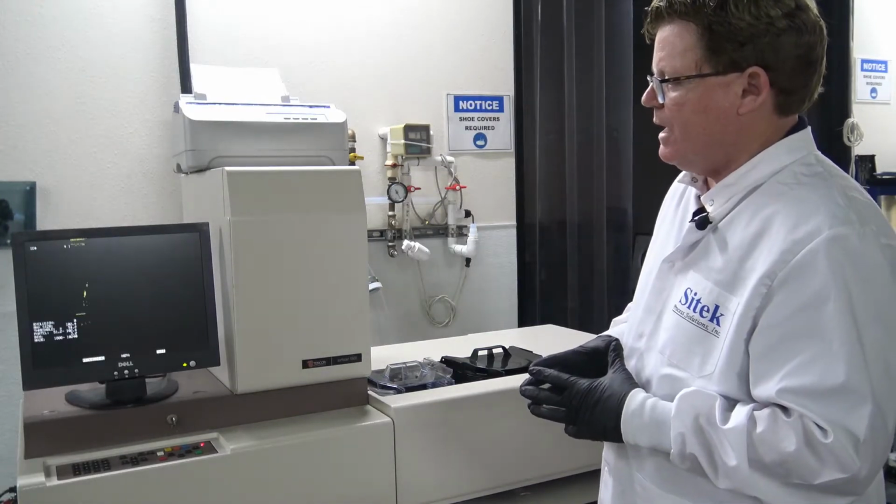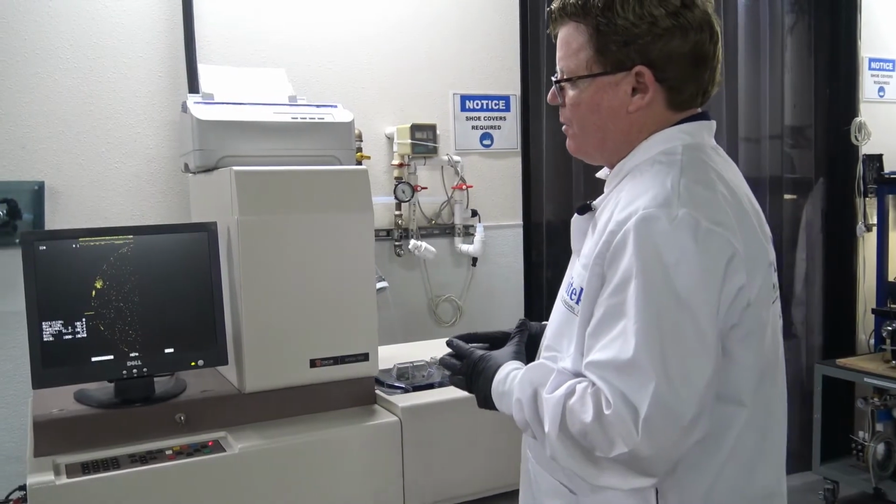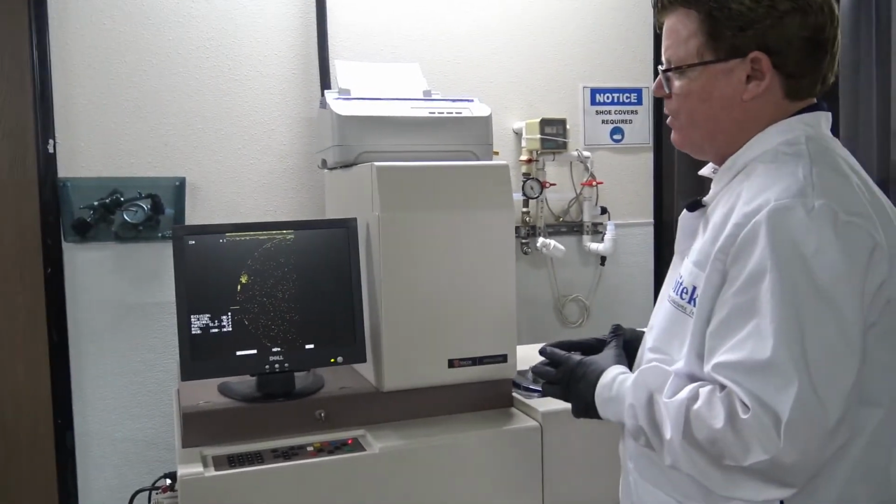Let's hopefully see if the haze now is not too high, or if it falls under the parameter I need. If not, I'll grab a brand new wafer for the next test.